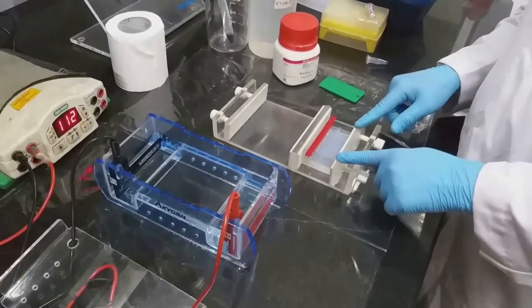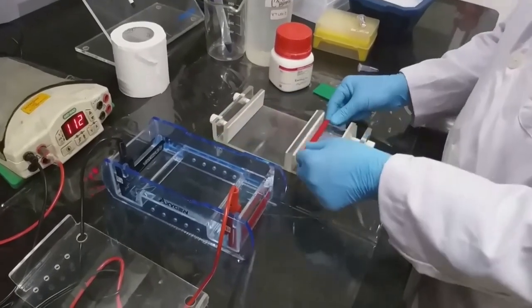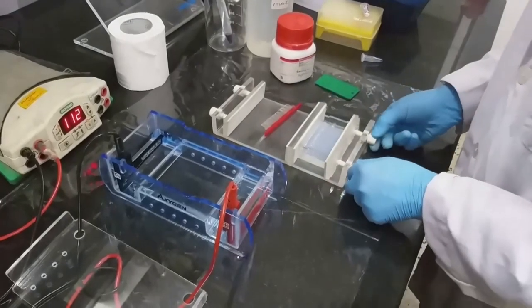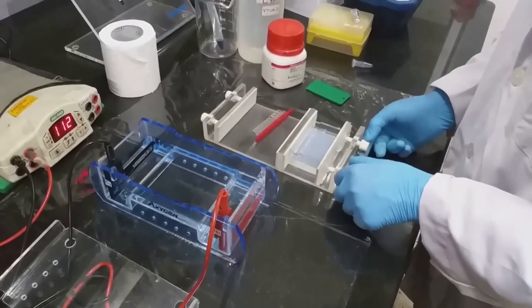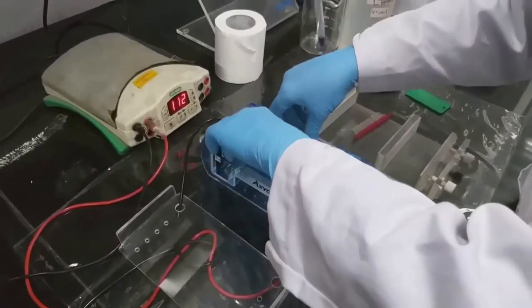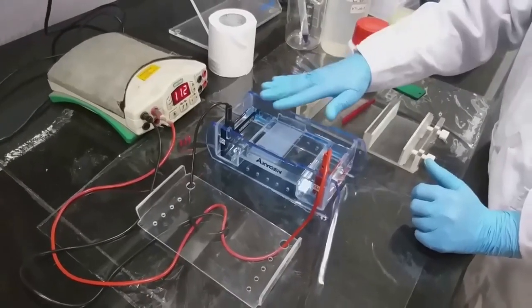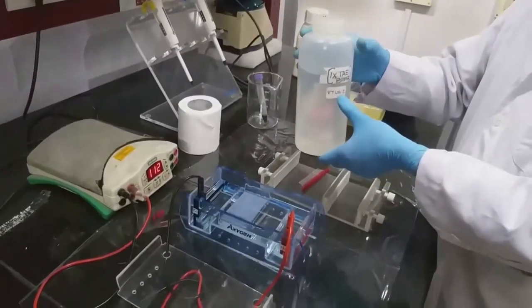Now the gel has solidified, we have to take out the gel and keep it in the electrophoretic apparatus. We have to gently remove the comb. Loosen the knobs, and keep the gel in the apparatus. Make sure that the gel is submerged in buffer. We have to fill the remaining part with 1x TAE buffer.